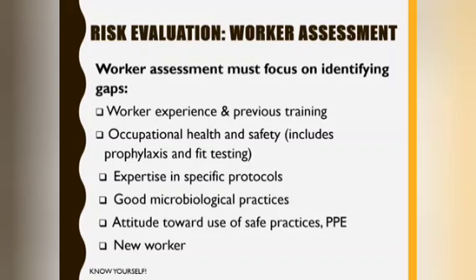Worker assessment. This requires you to know your staff, their strengths, capabilities, and proficiencies, and identify training needs. Worker assessment must focus on identifying gaps, keeping in mind the worker experience and previous training, occupational health and safety, their expertise in specific protocols, good microbiological practices, their attitude towards the use of safe practices and PPE, and a new worker.